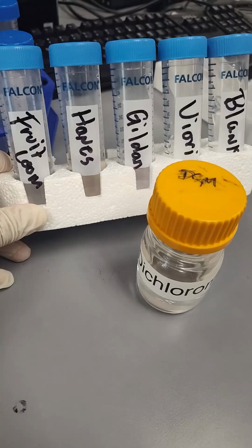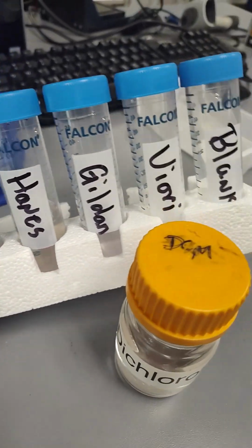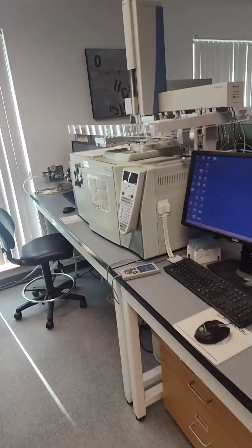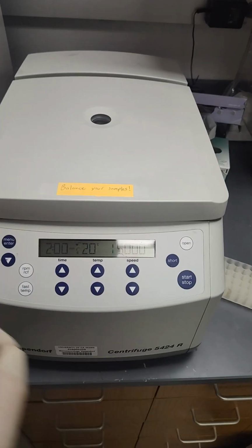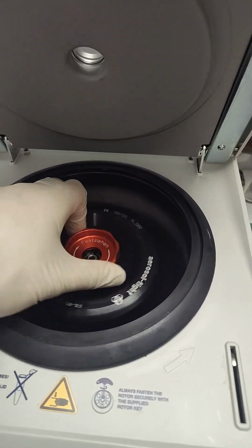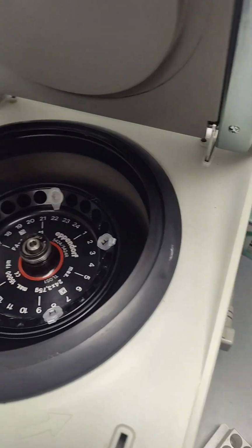Back at it. All right, DCM liquid extract, all the t-shirt water extracts, head into the GCMS. We're going to go ahead and crimp cap it into GC vials this time. It's on the centrifuge. All right, off the centrifuge. Should be a really good split.